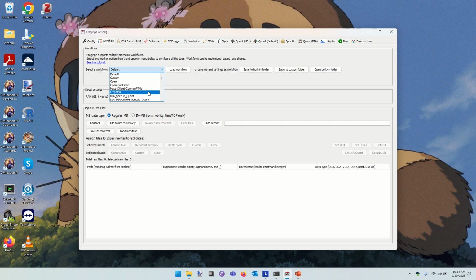So it's commonly the case in proteomics that if you're quantifying something, you buy some expensive reagents to, for example, tag each of 4 different samples with a different label on each of the peptides, and then you use that for quantifying more accurately.